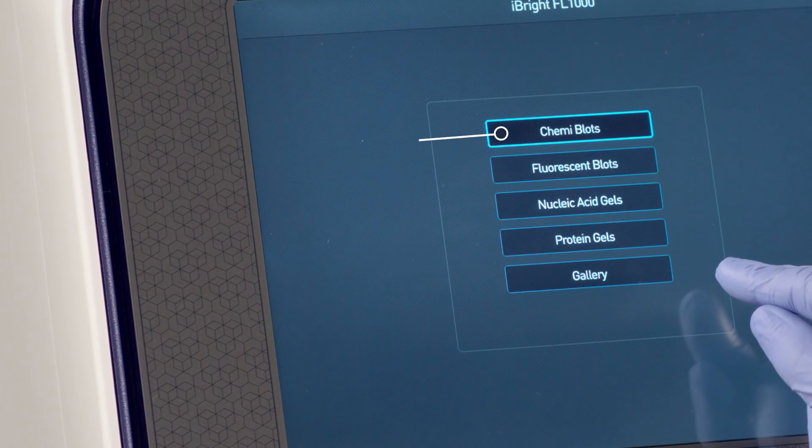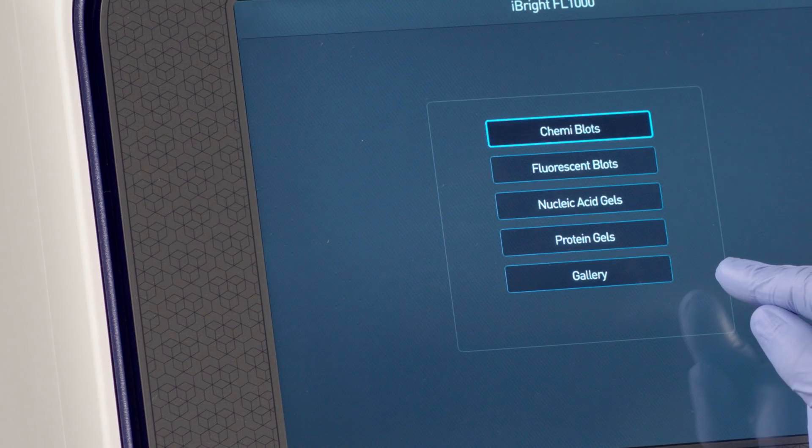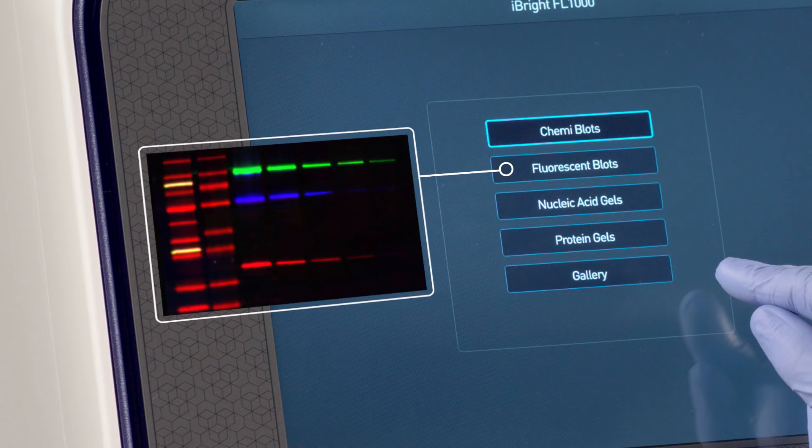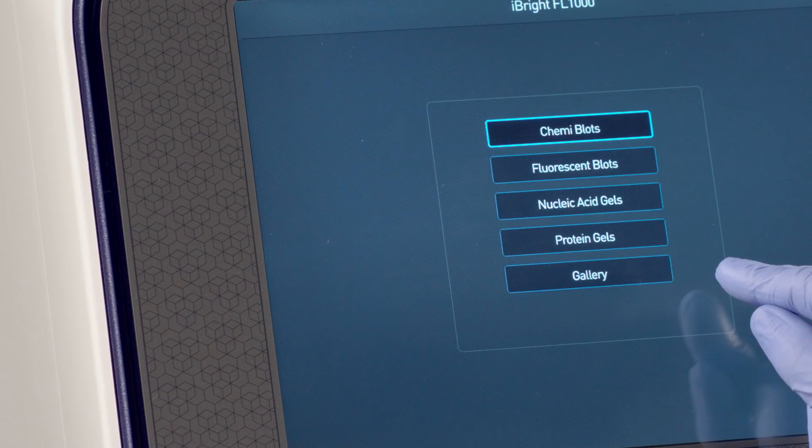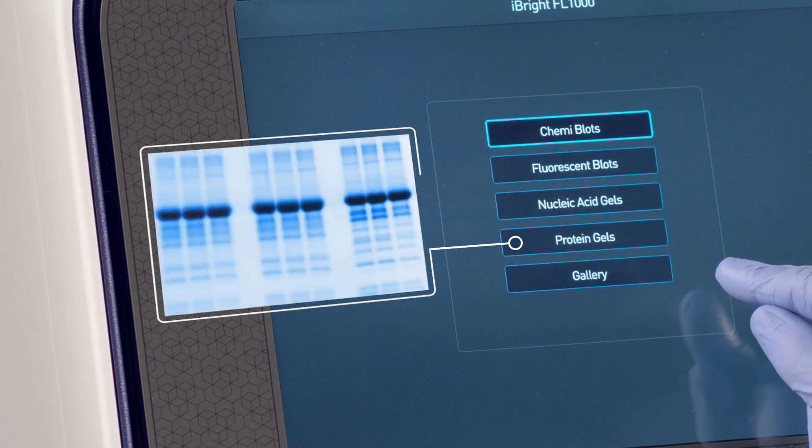Choose chemiblots for imaging Western blots probed with HRP or AP conjugated antibodies, fluorescent blots for Western blots probed with fluorescent conjugated antibodies, nucleic acid gels for DNA and RNA gels, or protein gels for visible stained protein gels.